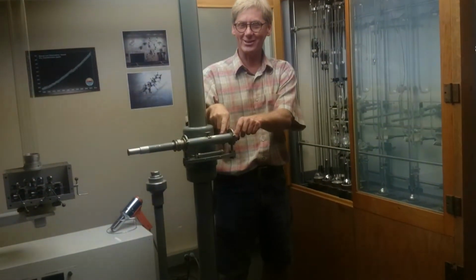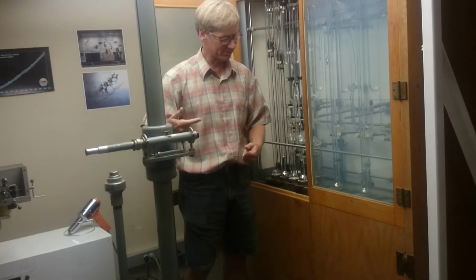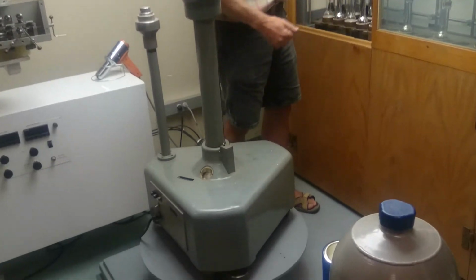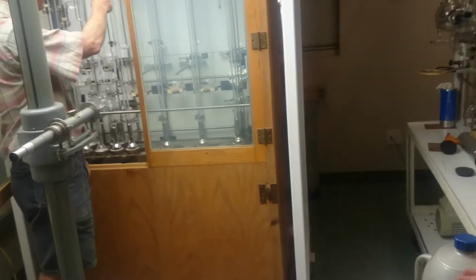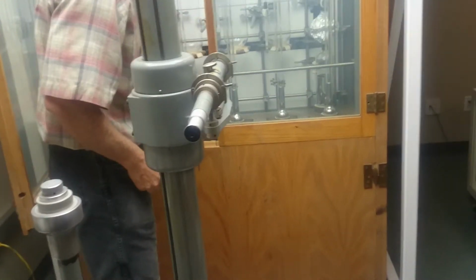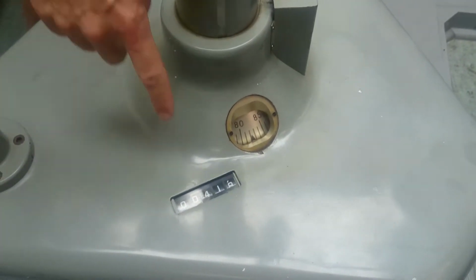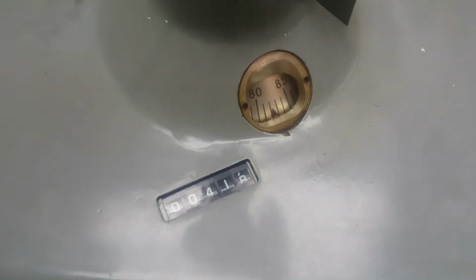So this is basically a short-range telescope, a cathetometer. It looks over here. It's all fixed angles. You look in here, and you dial this thing up or down until it's looking right at that thing, and then you dial it up until you're looking at the top of this level here. You have these little cards here so that you can very carefully see the top of the mercury column. They have little pointers to establish fixed levels. So the basic measurement was just this number right here, how high up or down that was going. But then you also had to measure temperatures.